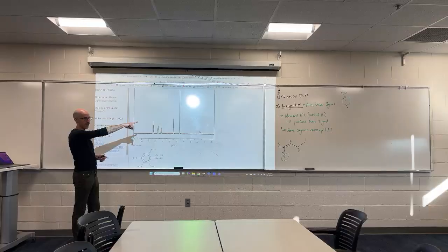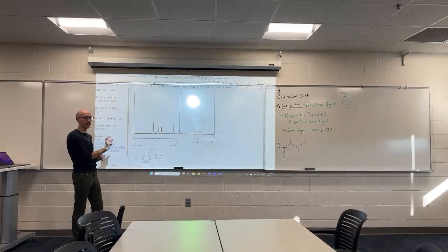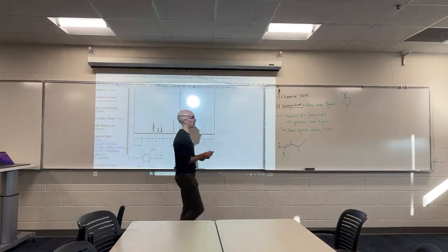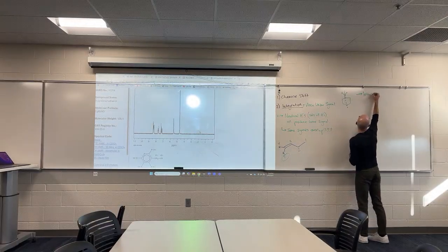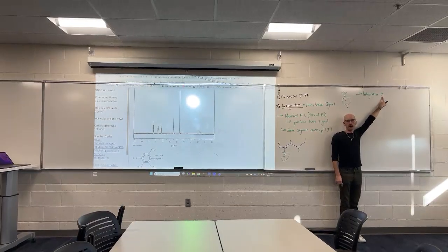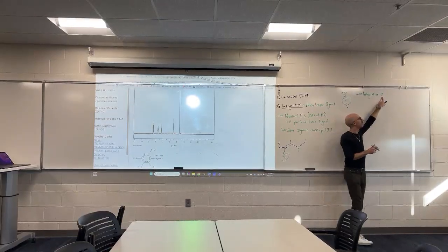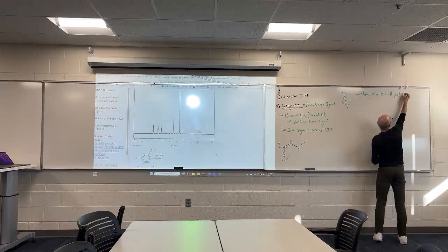But we've got this issue, remember? Hydrogens that are all identical produce the same signal, and sometimes signals overlap. Here's the beauty of having integration. Integration is proportional to, I think that's a math term, that little symbol. If you don't want to write that symbol, you can write it out. Integration is proportional to the number of hydrogens producing a signal.